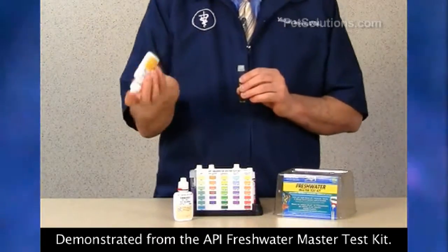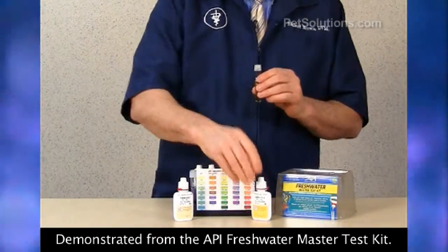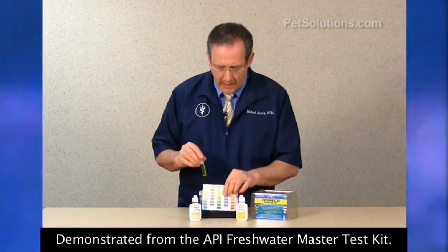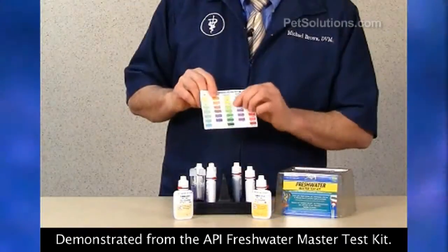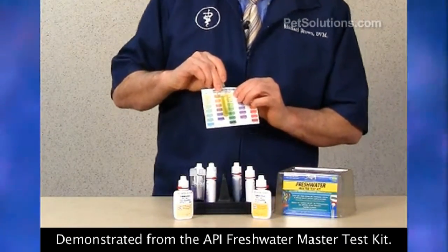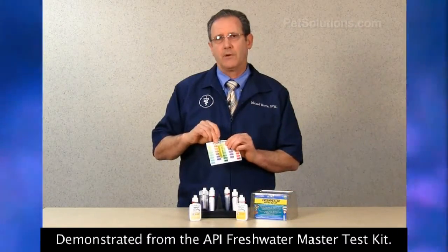Same thing with test solution number two — add eight drops. You wait about five minutes for the color to develop, then go to your ammonia chart and compare colors. This one's between zero and 0.25 level of ammonia, which is nice and low.